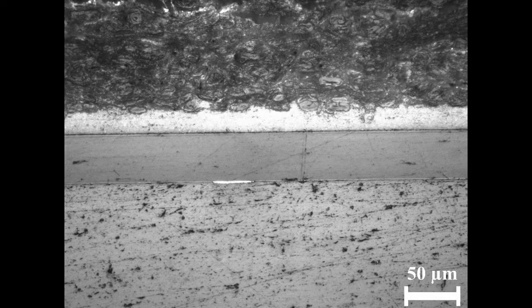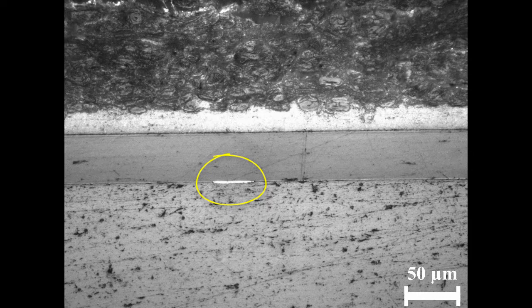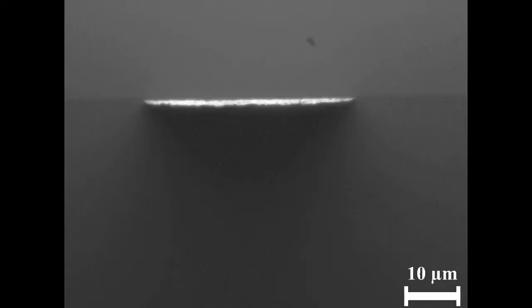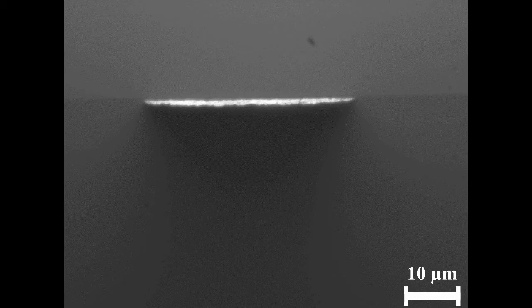Here you have the same cross-section of the paper at higher magnification. Now the printed ink is clearly visible. The last image shows it at the highest magnification of the microscope. This is the end of light microscopy. Now the sample will continue into the scanning electron microscope.